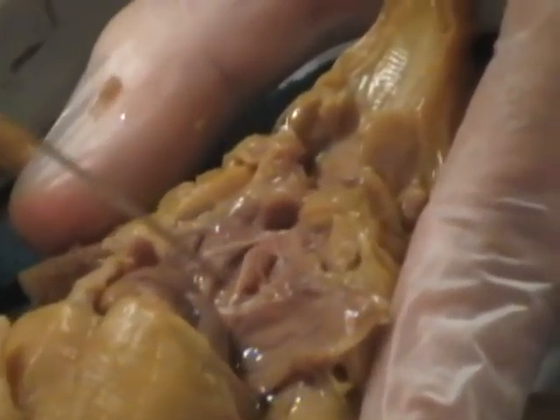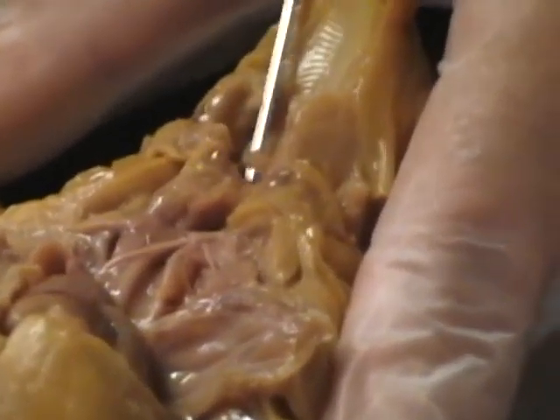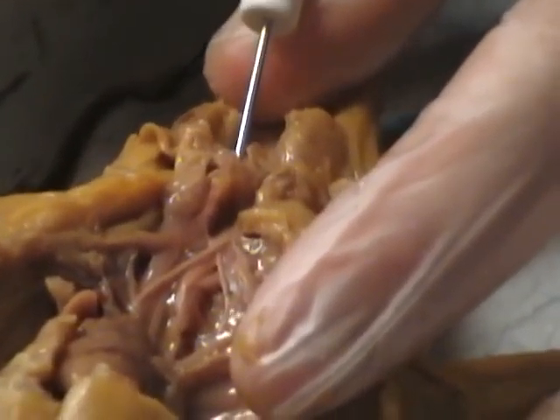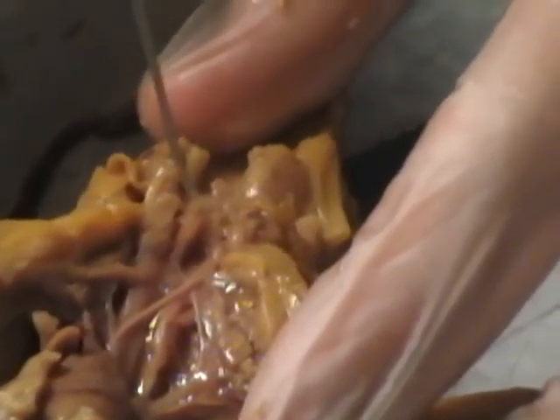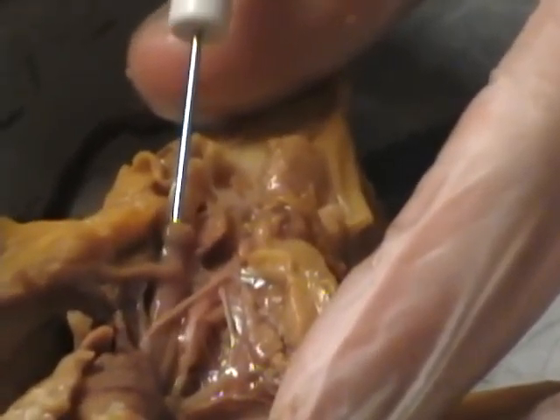And let's see. This is the trachea. So I'm inserting my probe into the trachea right now, which is the windpipe. That's right there. This is the esophagus. That's gonna run down to the stomach.